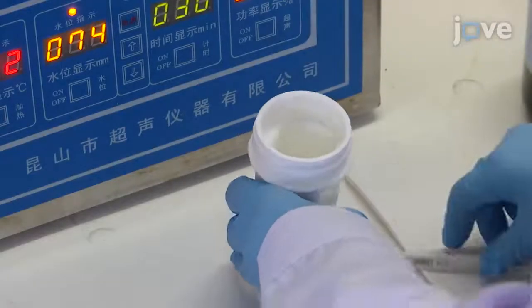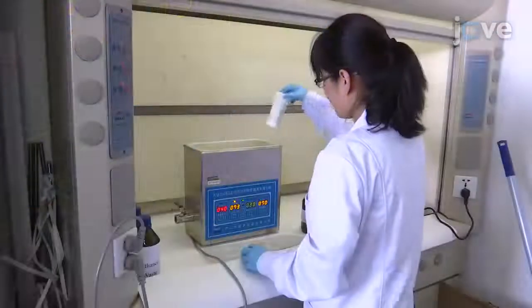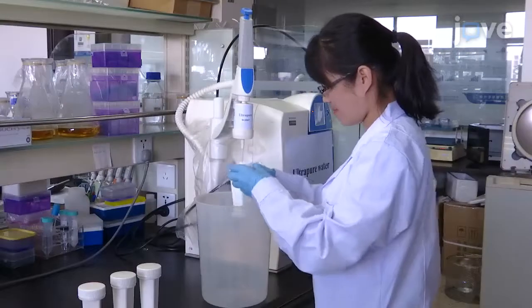To clean the coverslips, place 20 coverslips into 4 staining jars, pour ethanol into them, and sonicate for 30 minutes in ethanol. Then rinse the coverslips with ultra-pure water 3 times.